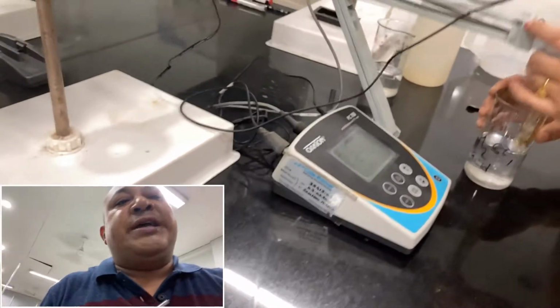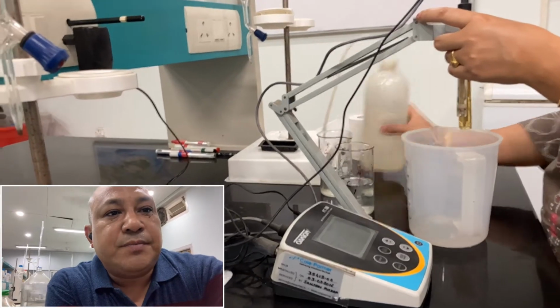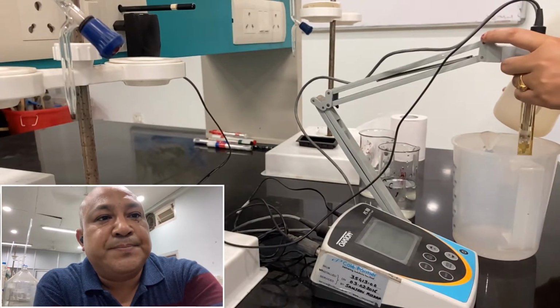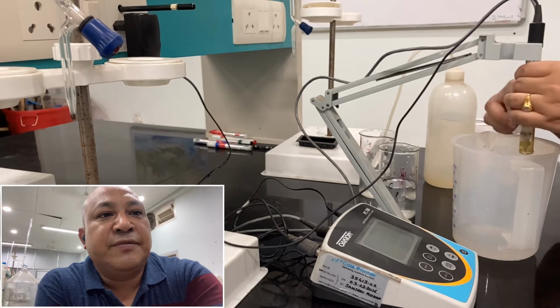Now we are going to change to a new sample. For a new sample, we wash with distilled water, clean with distilled water from the bottom, and then rub with tissue paper from the bottom itself.